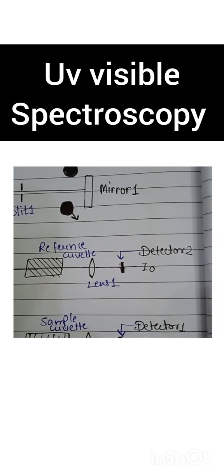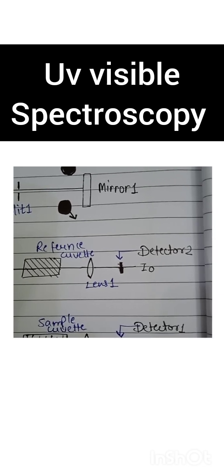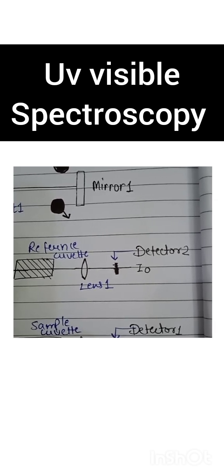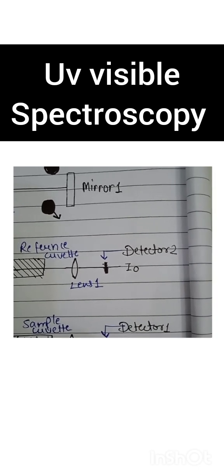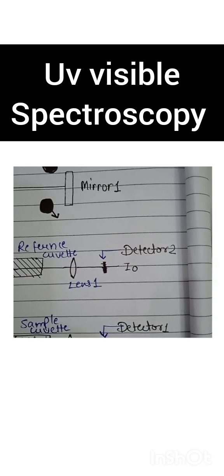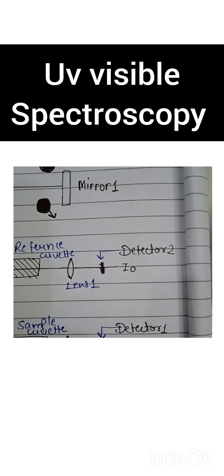With low noise and high sensitivity, spectrometers normally contain either a photomultiplier tube detector or a photodiode detector. Other specialized detectors are found on high performance systems to improve wavelength coverage or sensitivity. Each detector has a different sensitivity and wavelength range. For systems with multiple detectors, the system will switch to the detector corresponding to the required wavelength range of the measurements.